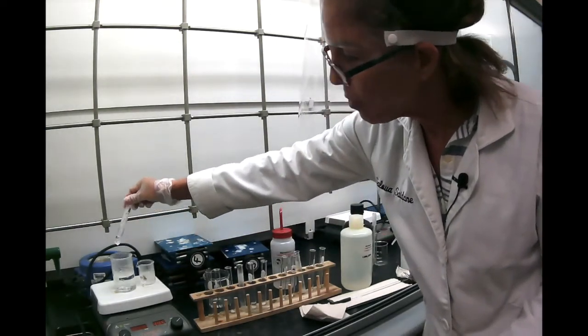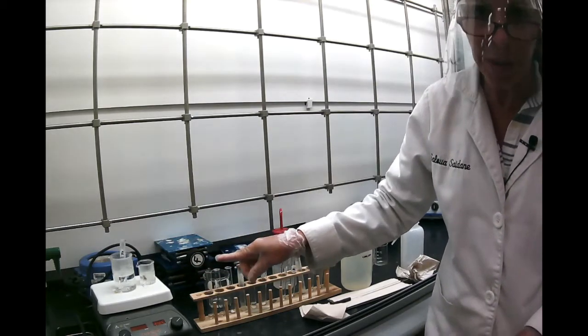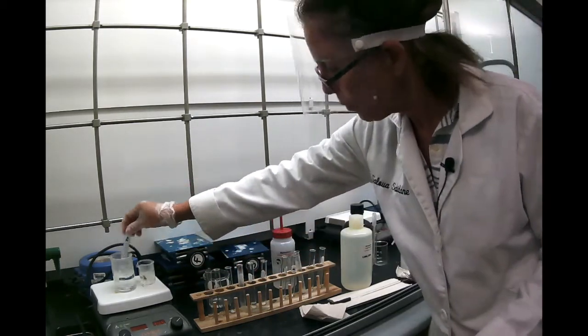Now let me go back to benzoic acid. I just want to show you that it's dissolving. So benzoic acid dissolves in hot water. So we'll put it back here.